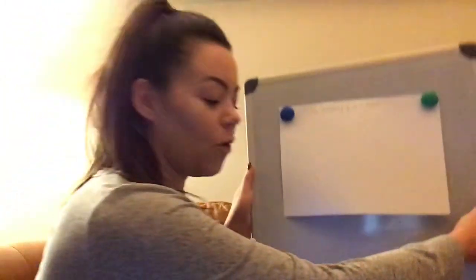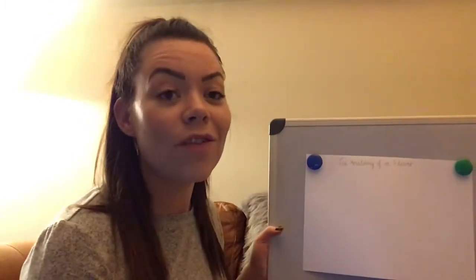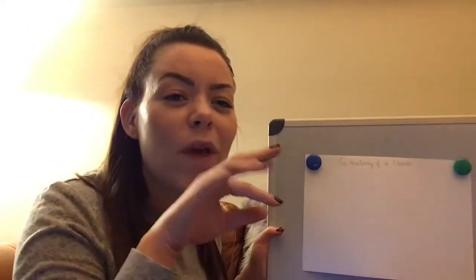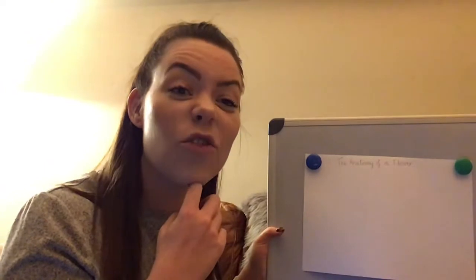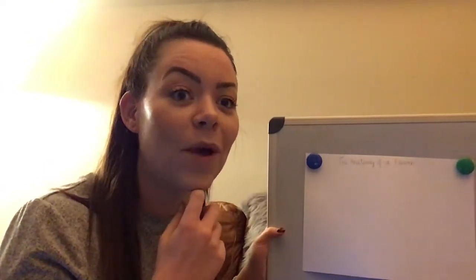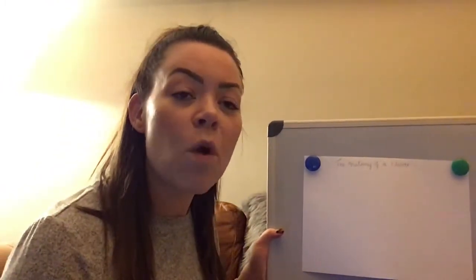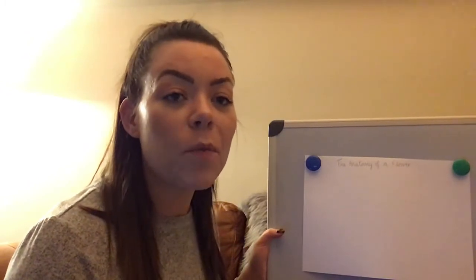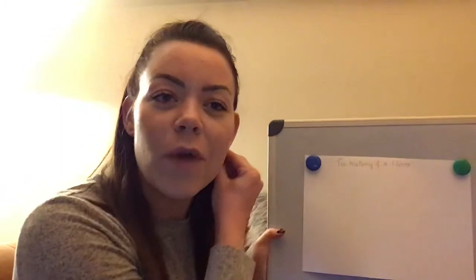I've written that on my page as a little title. I asked you to word zap the word anatomy because it's a posh science word. It's a scientific word which means looking at how lots of different things work and pulling it apart to have a look at its structure, which means how things are made up inside the flower. So we're going to pull it apart and have a look at all the different bits. Make sure you've watched the little video that I've put on the website to help you understand a little bit more about what I'm doing as well.